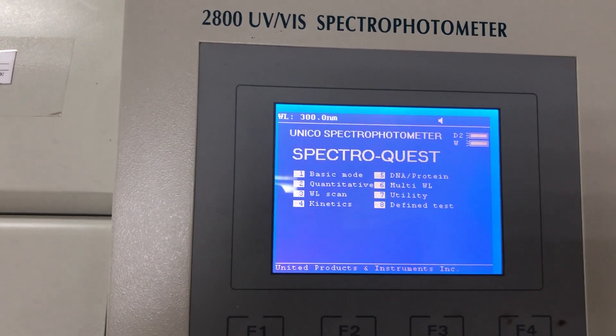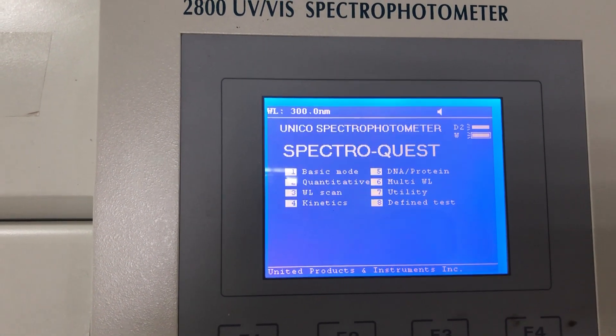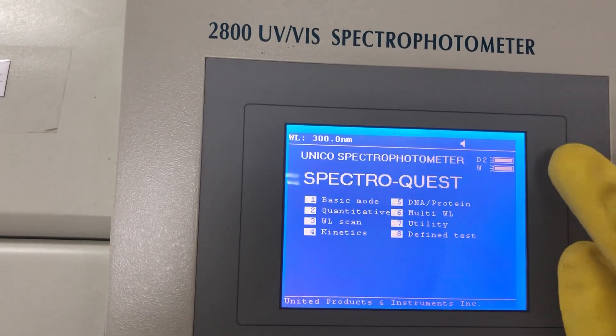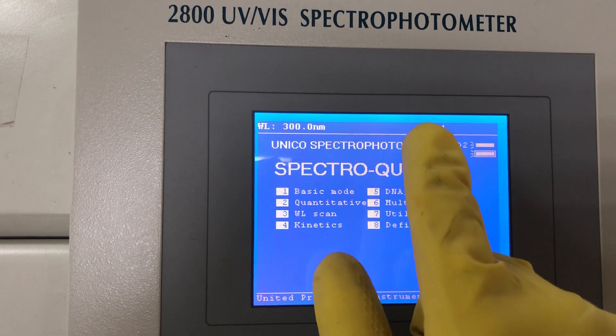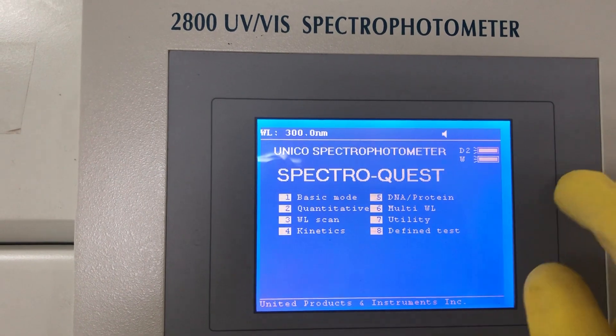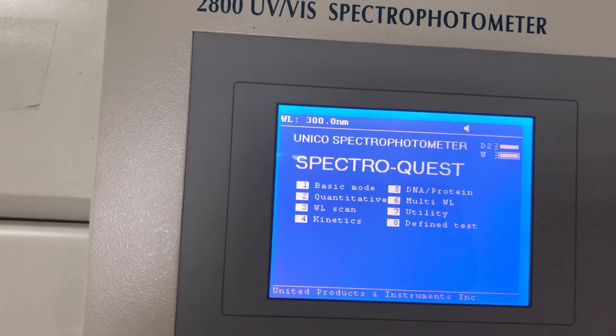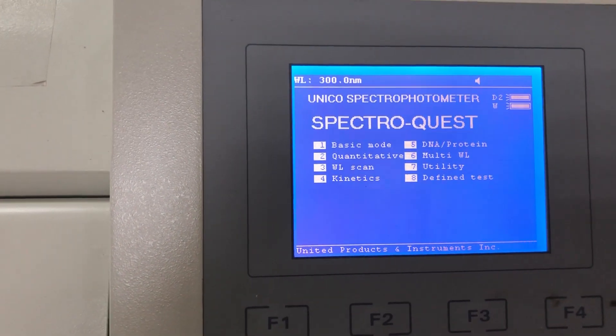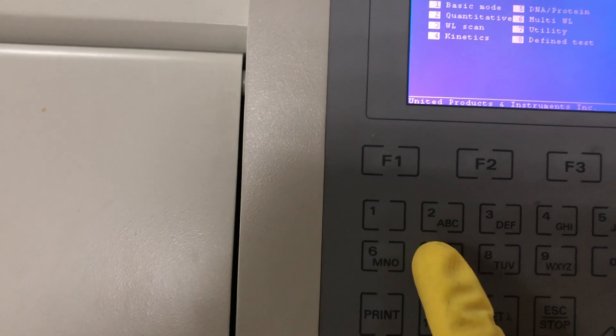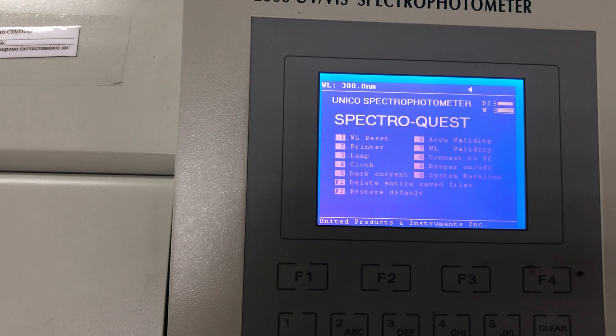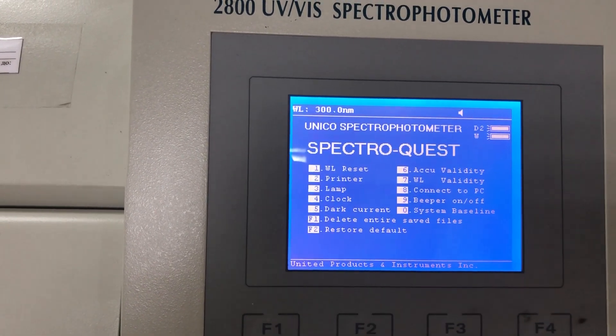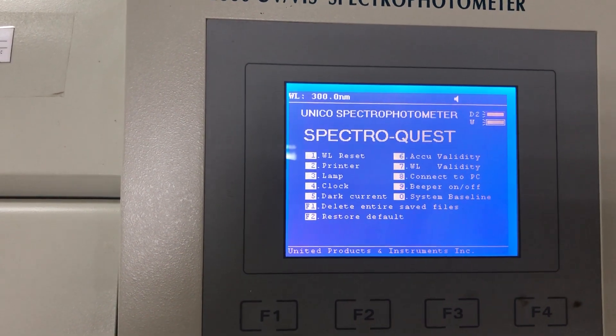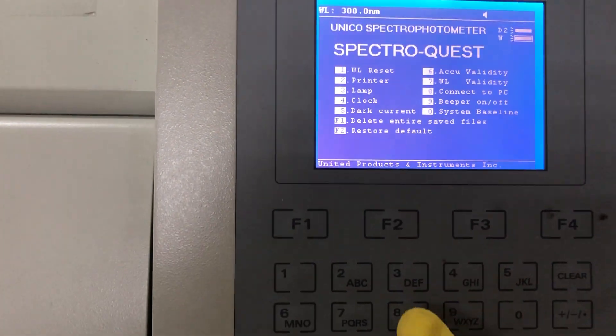Here sometimes the instrument gets stuck when D1 and D2 are not working, even when the arrows show D1 and D2 are working. Before we start, we can use number seven. Press number seven here from the keyboard to get into utility. Here are the settings of all the device partitions. We have to go to lamp number three, press number three here.